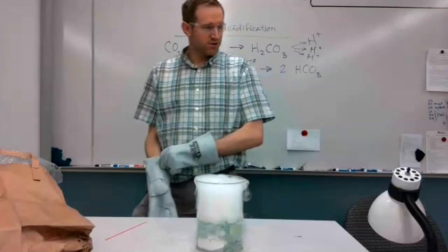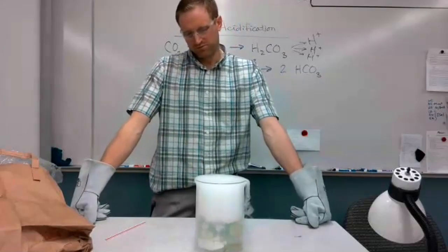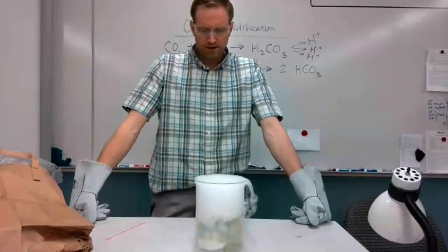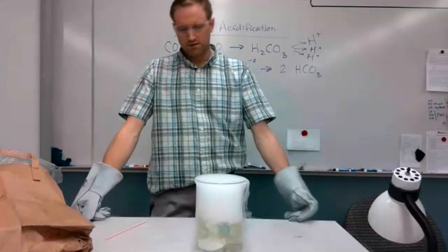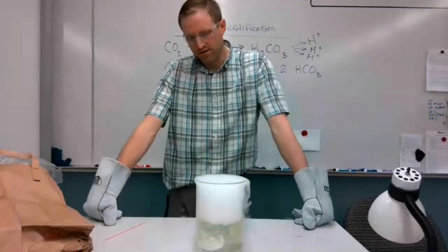All right, notice the color change going on. It's pretty rapid. Okay, now we're going to a pretty solid yellow here, not just a green.